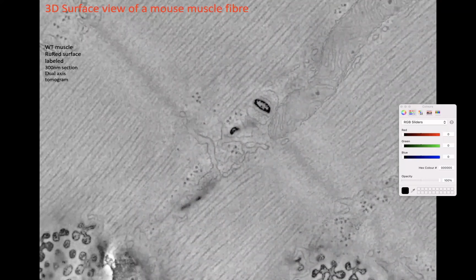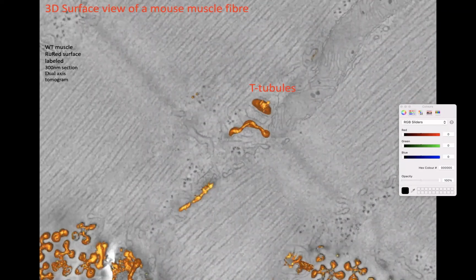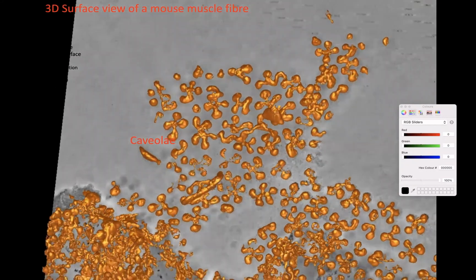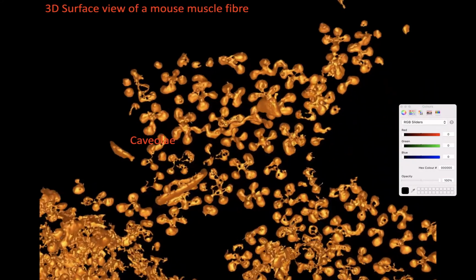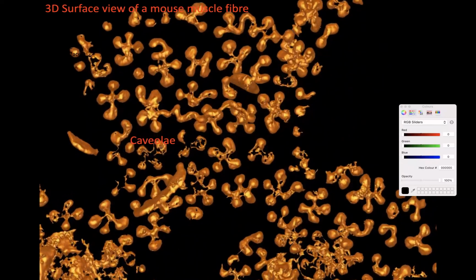As we go deeper, we can now see these T-tubules. These are tubules that go down into the depth of the muscle. We're coming back out again, and we're thresholding these structures. And now again, you can see the caveolae, and you can see how complex these structures are. So the caveolae really increase the surface area of the muscle. This is a completely controlled wild-type muscle, and they make this very specialized organization driven by the caveolae.